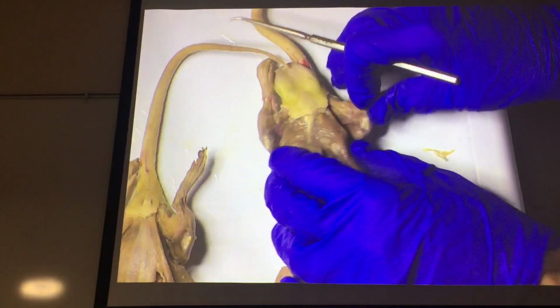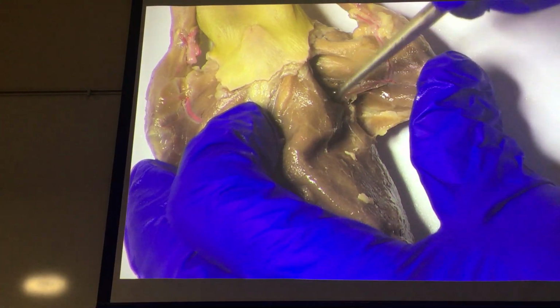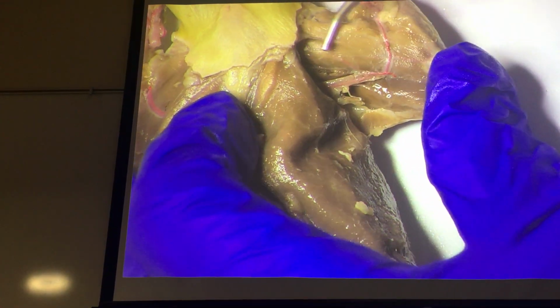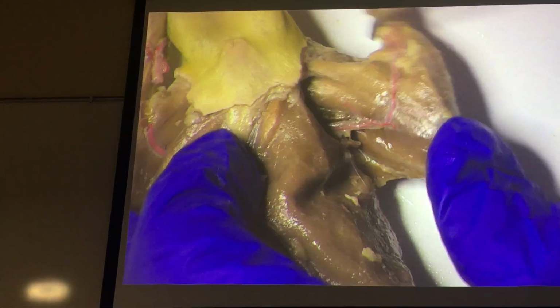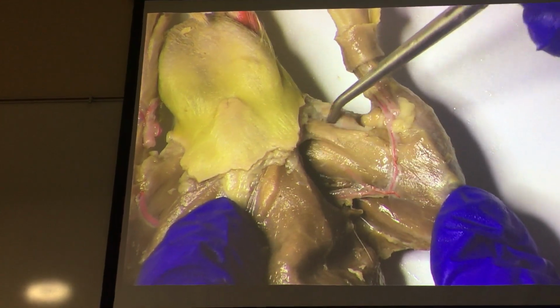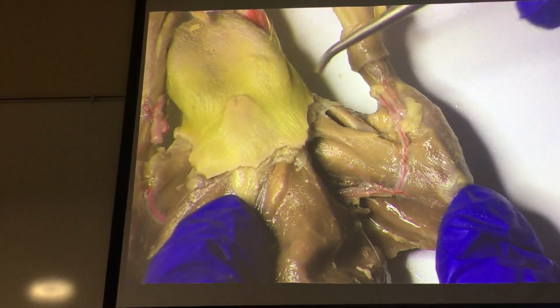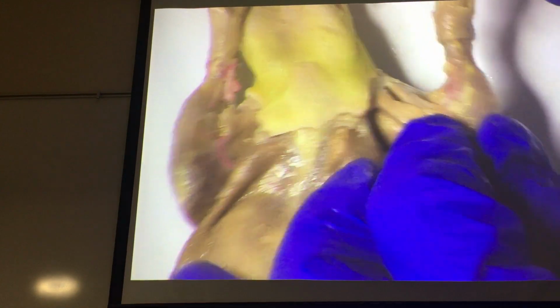All right, staying on the ventral aspect as we work our way along, obviously external abdominal oblique. We come down here, and we see this muscle kind of running at an angle. That's our pectineus, mostly gracilis, gluteus superficialis. Might see a little bit of semitendinosus underneath here, but that's more of a deep muscle and wasn't separated out anyways. In the front here, we have our tibialis anterior.